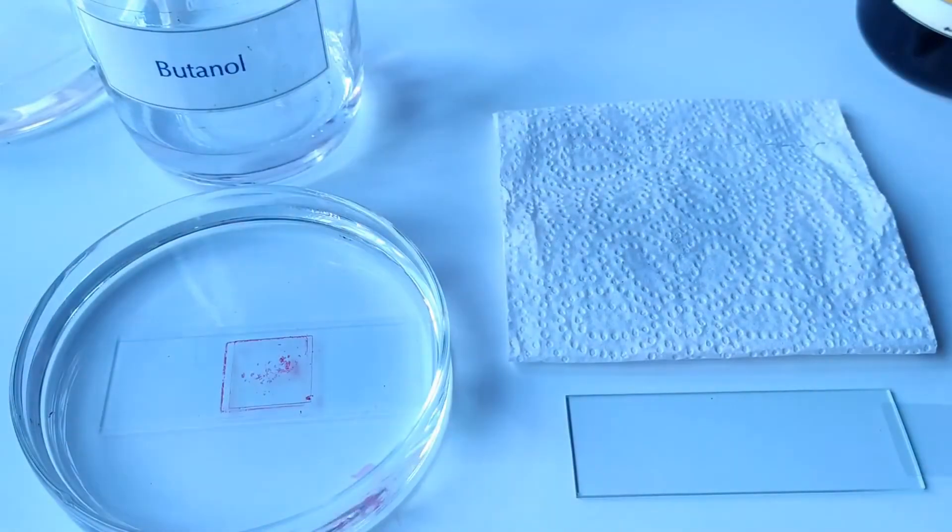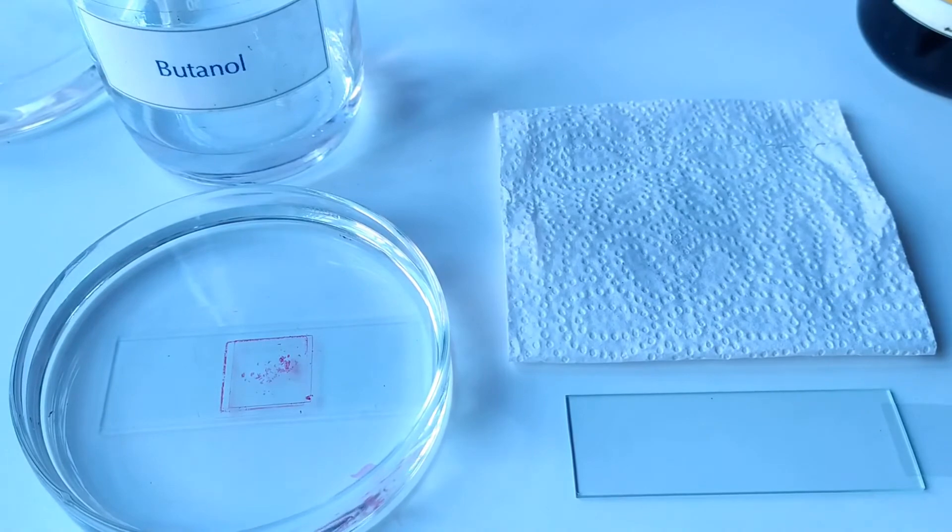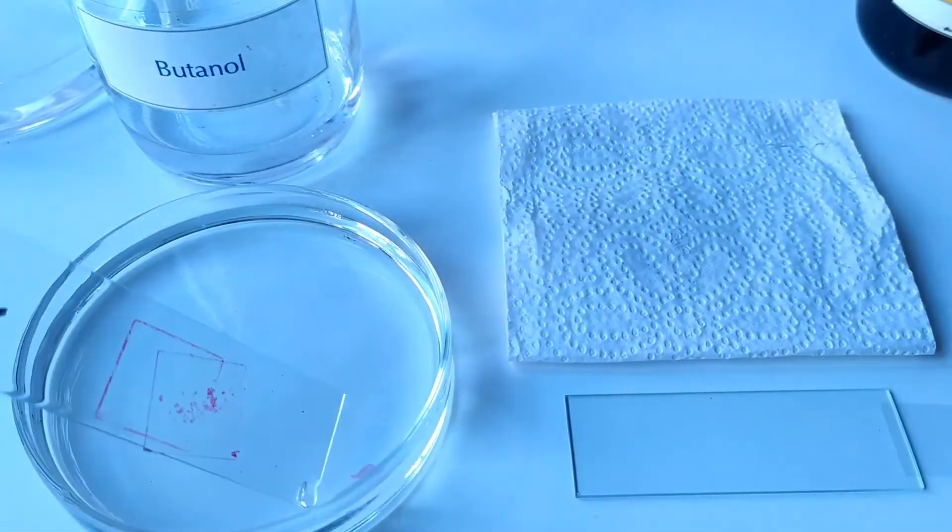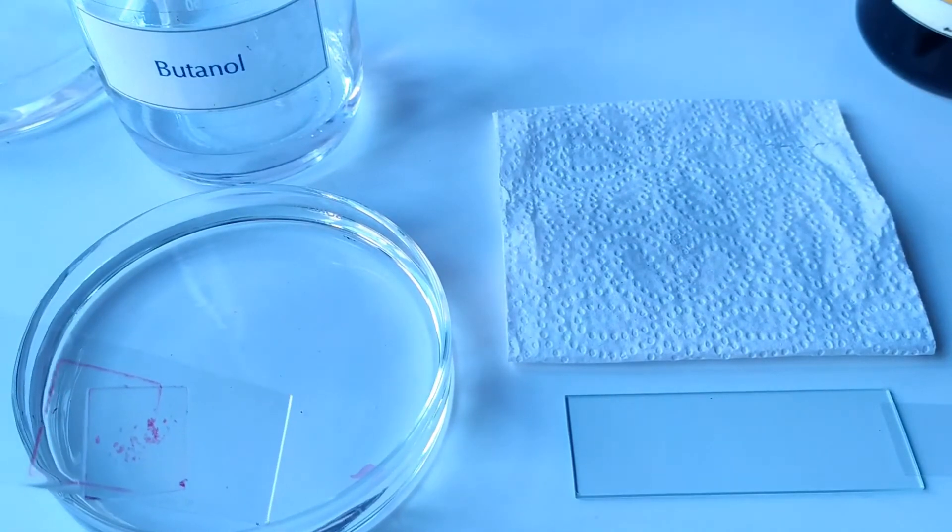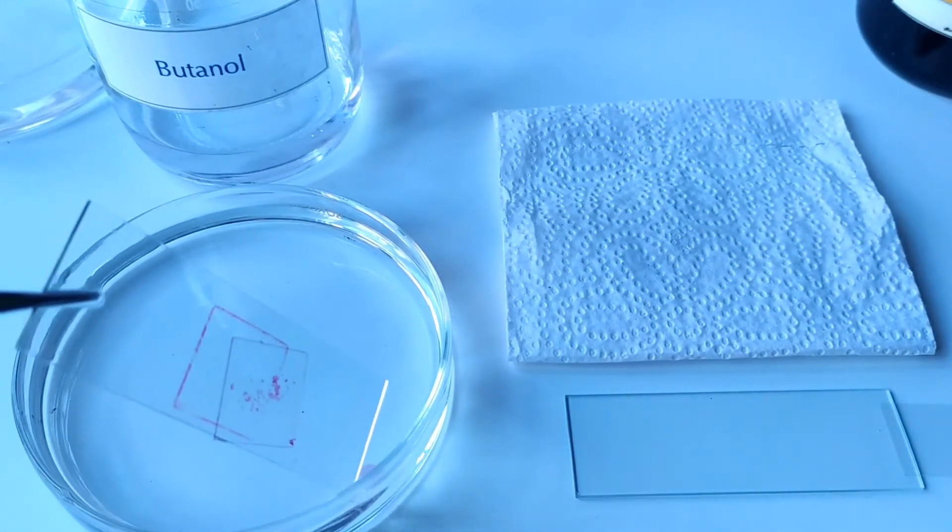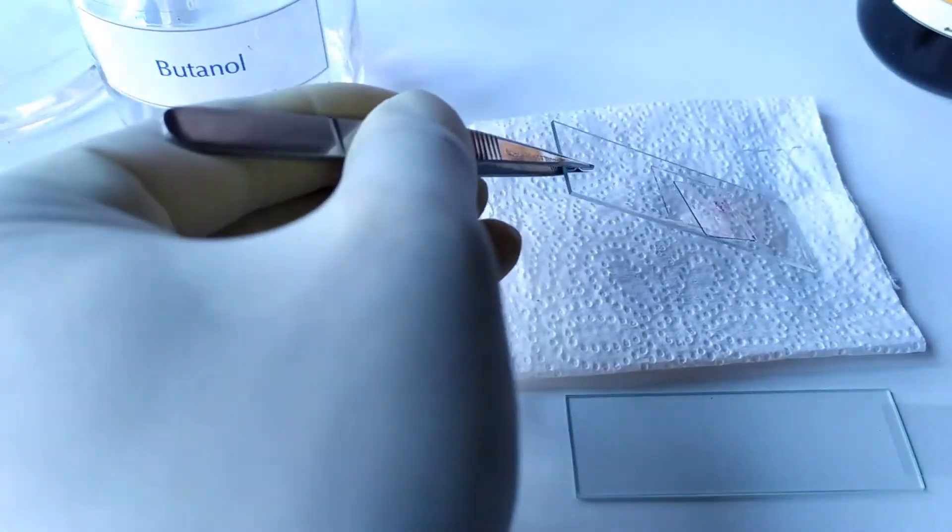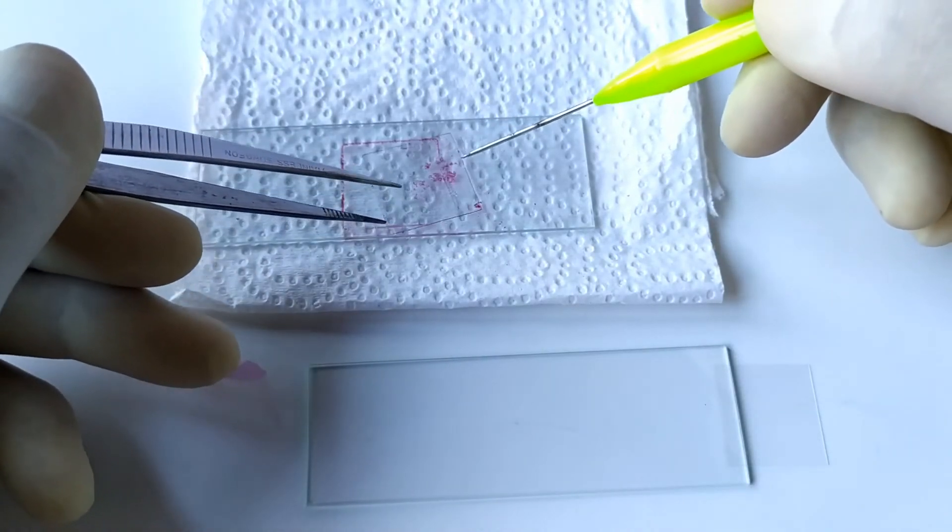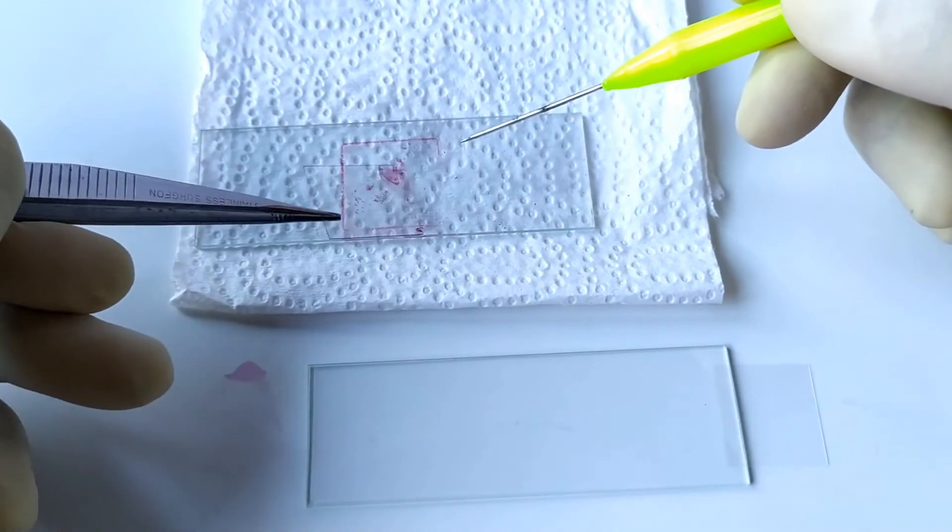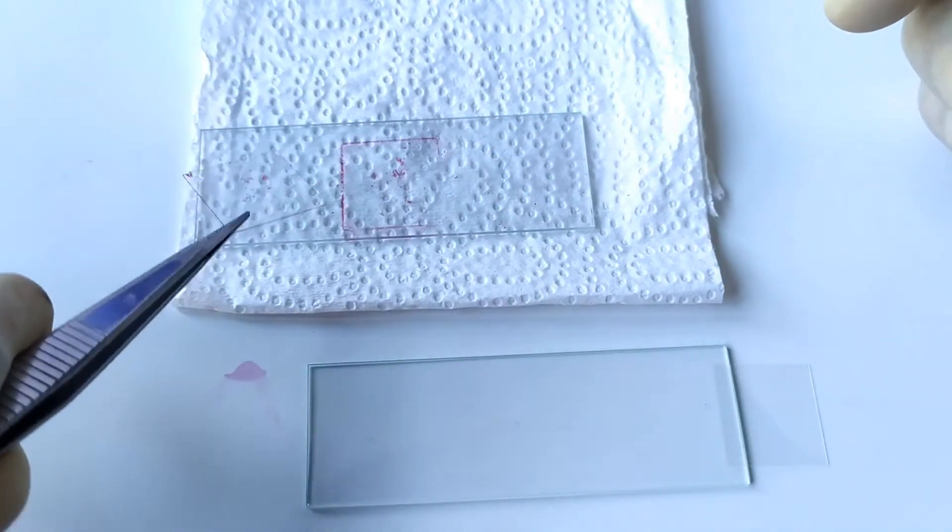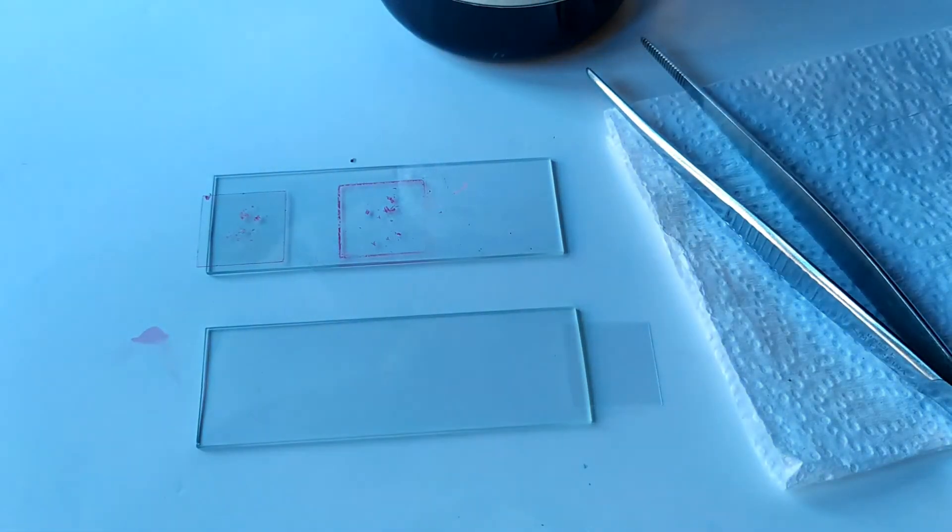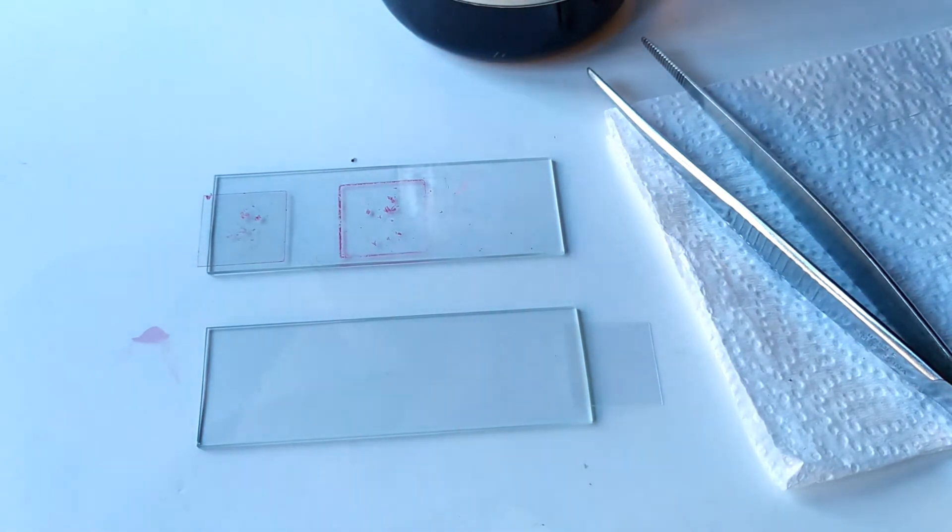Now carefully remove the slide and cover slip from the butanol solvent and rest the cover slip with the lower surface facing up. Allow the material on the slide and cover slip to partially air dry for a minute or so.